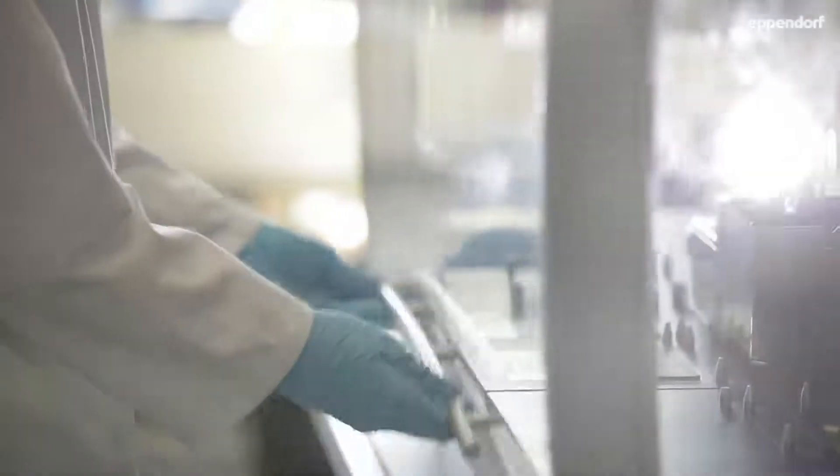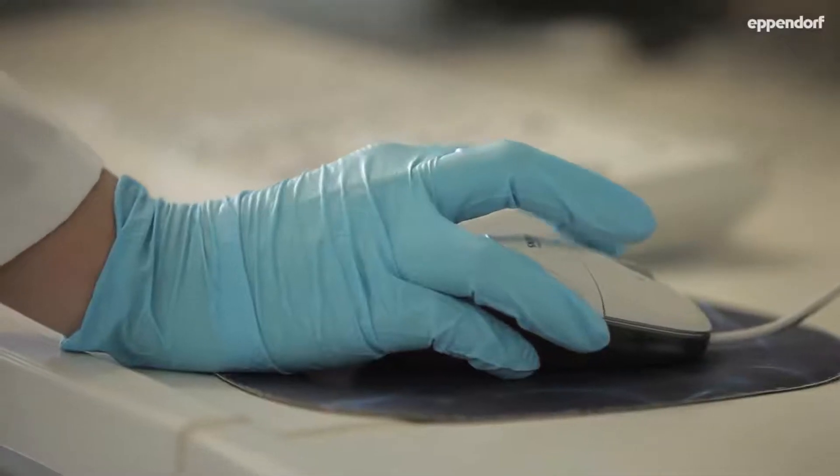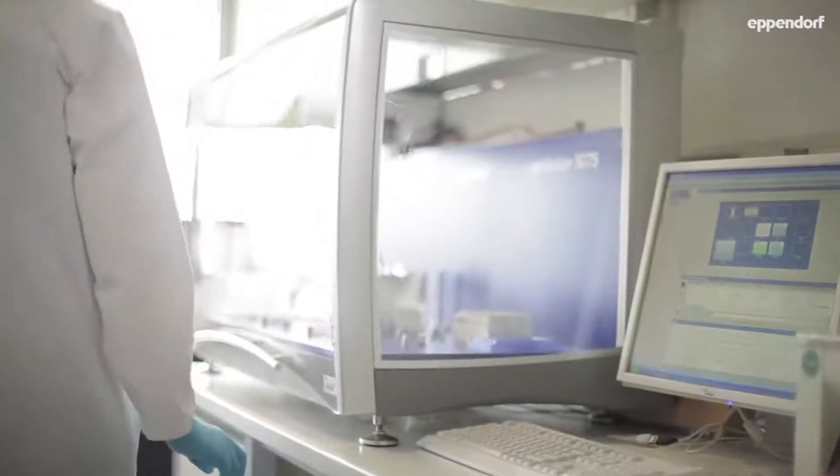First, I was very skeptical to use a liquid handling machine because I thought it would be much easier to pipette a plate by hand than to learn difficult software. But the first demonstration of the AP Motion changed my mind.